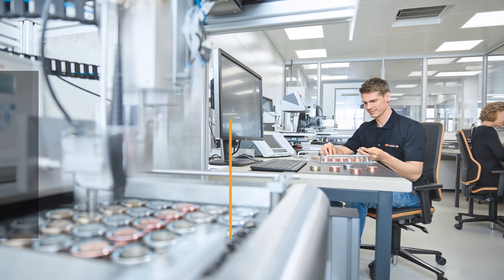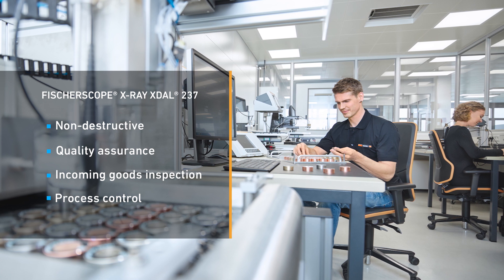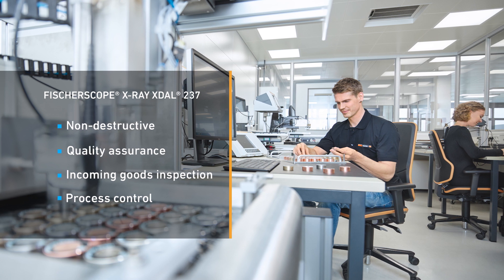With its fast, programmable XY stage, it's the best solution for automated measurements with small or large samples, in quality assurance and production monitoring.